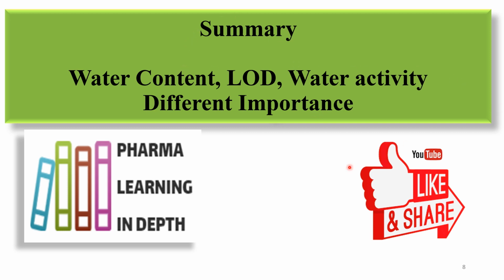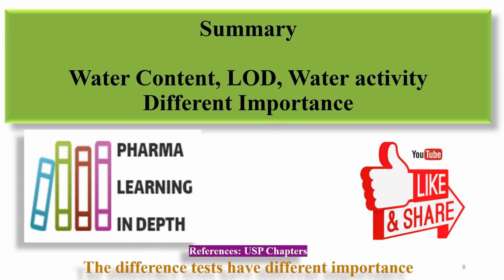LOD and water content are mainly done for potency calculation, or to check the potency of the material, and water activity is mainly done to check if there is any potential for microorganism growth.